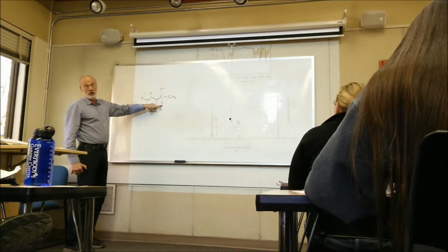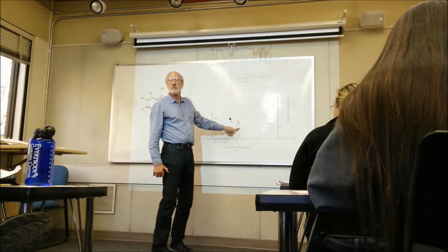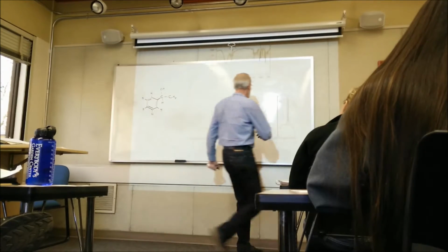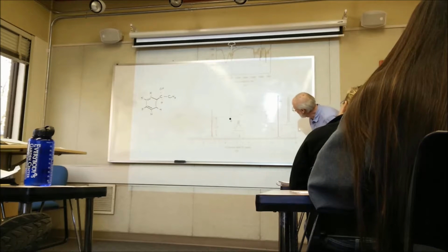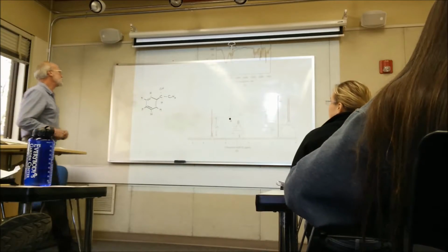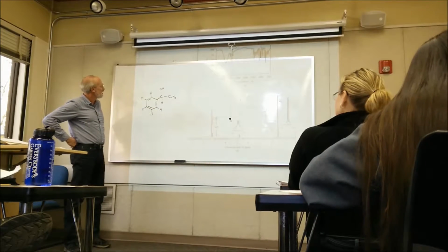A little above 4. Well, 2 to 5, depending. This thing, they don't show. That looks kind of like a doublet. Is that a methine? A methine would be if you only have a CH. I don't know how they classify that.